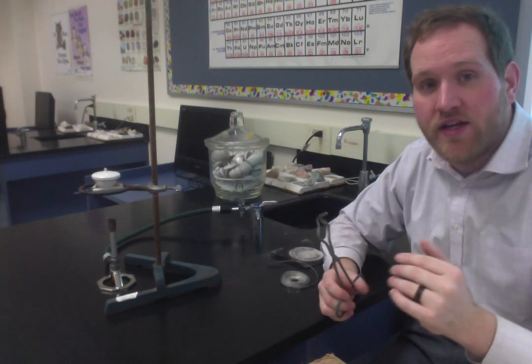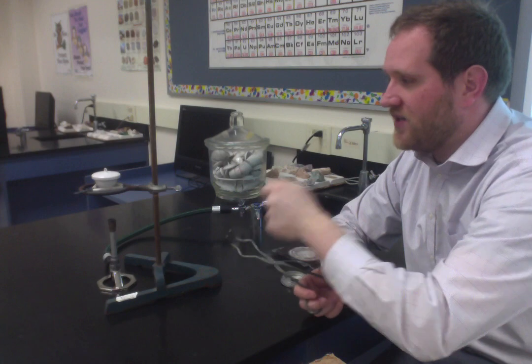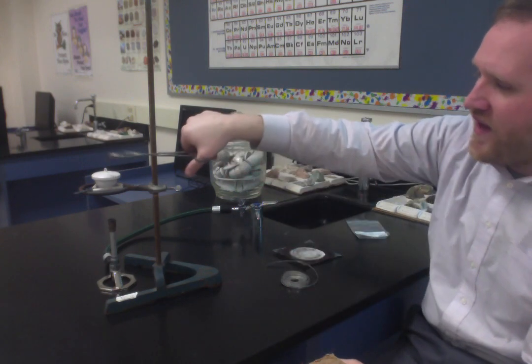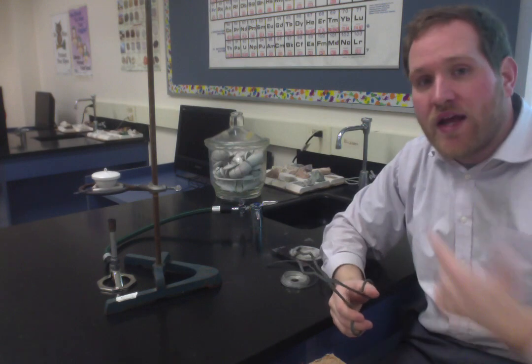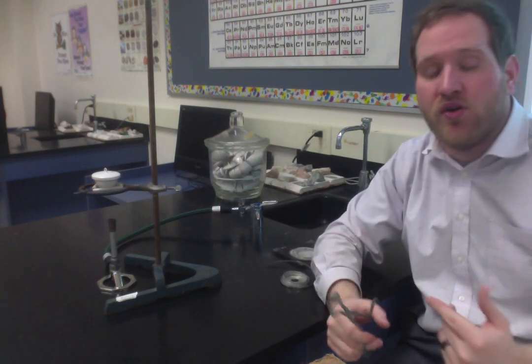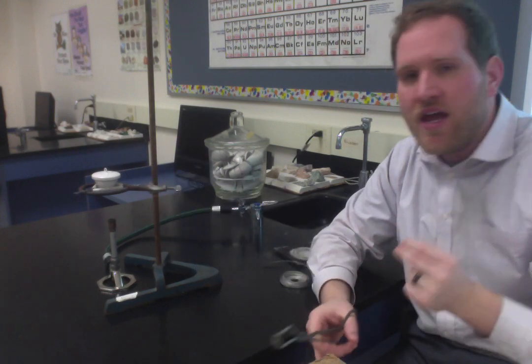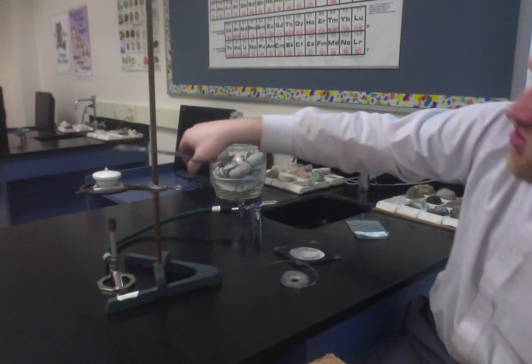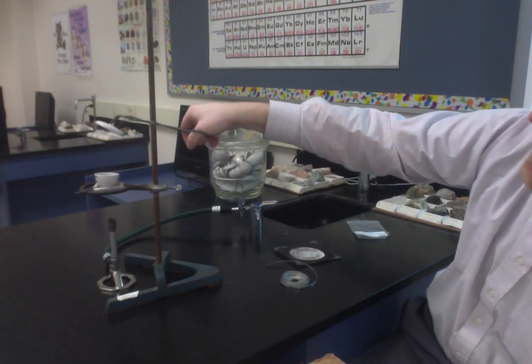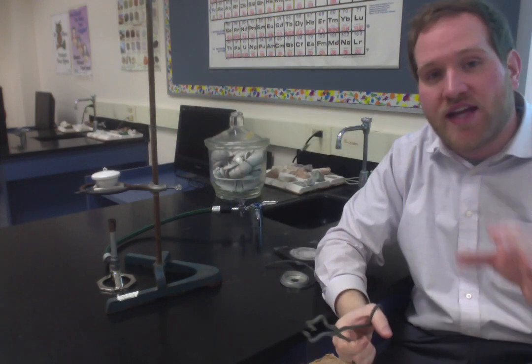Of course, you have already found the magnesium's mass. So we're burning the magnesium, burning the magnesium, burning the magnesium. What you want to start to do is vent the top to allow air to enter, because once it consumes the oxygen inside the crucible, it's going to pretty much stop burning. So what you need to do is allow more oxygen to get inside that crucible. But what you don't want to do is just grab this and say, go ahead, breathe, take all the oxygen you want. Because remember, I said before, we need a controlled, steady burn.